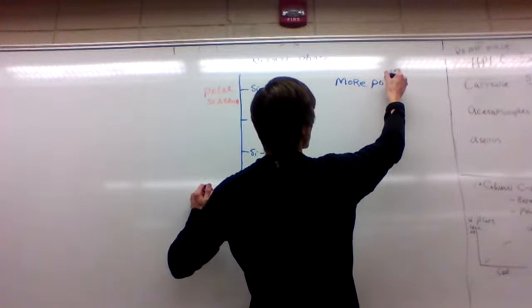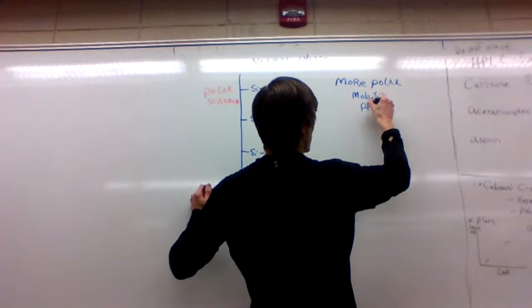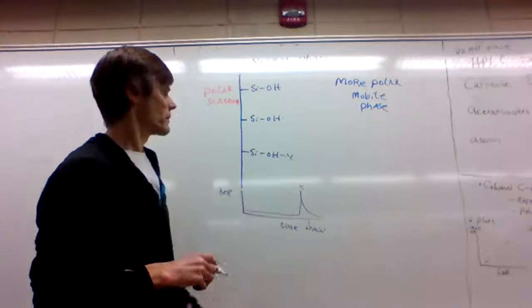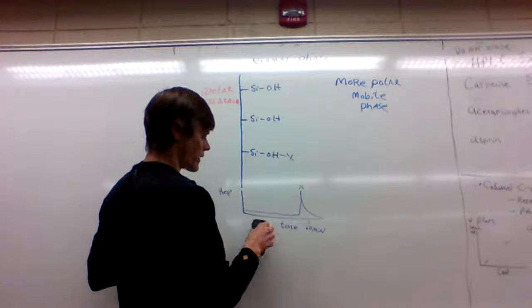A more polar mobile phase. Now, in this situation, what we're saying is we're making it stronger. Let's see what happens in this situation. Remember, 60 minutes was about how long it took.